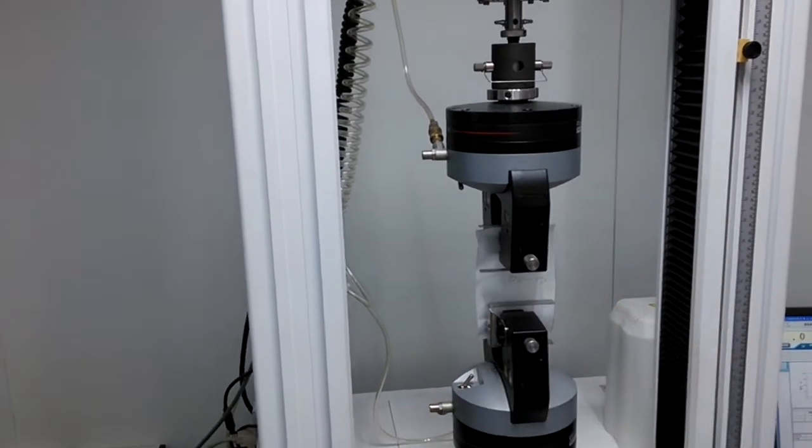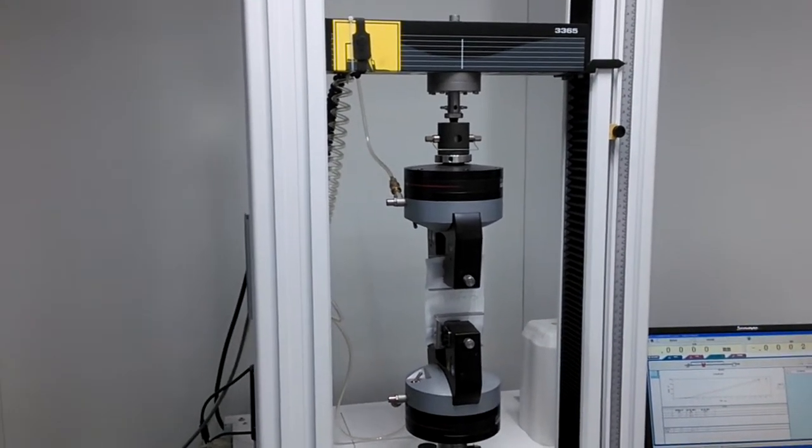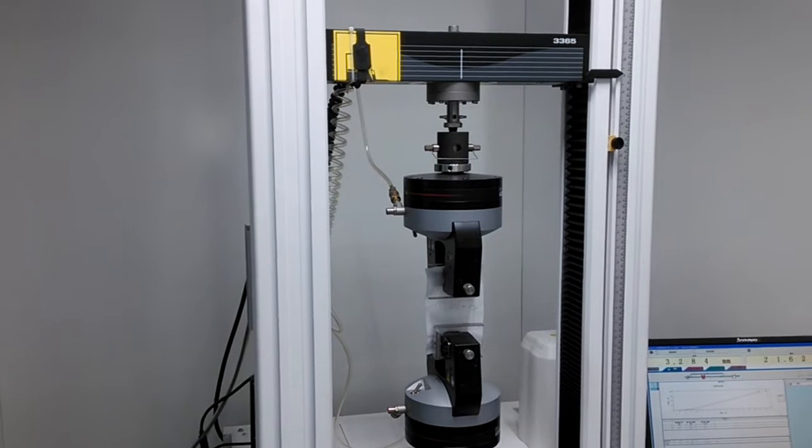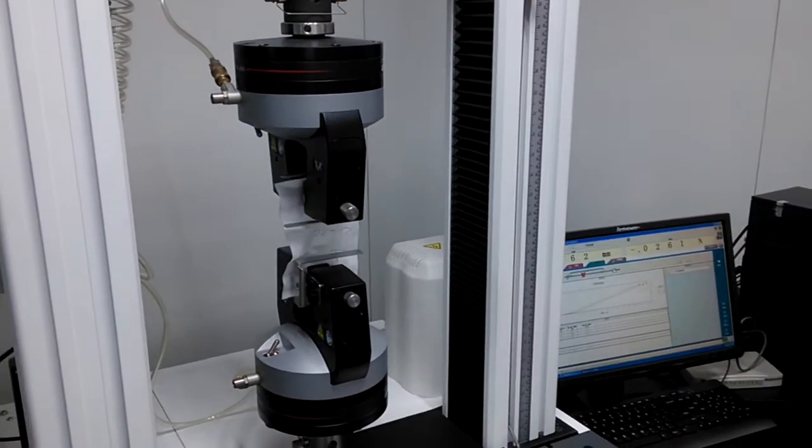The sensor of the equipment will record the maximum breaking strength of the sample, and the computer will display the data.